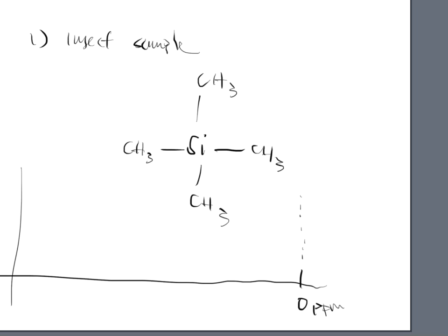Now, why is TMS chosen? There are a lot of things out there that have really low boiling points, so if it's just boiling point related, why aren't we using something else? Well, first off, another good thing tetramethylsilane has going for it is, number one, it has hydrogens, and these are equivalent hydrogens to each other. If you've noticed, it's a very symmetrical molecule.